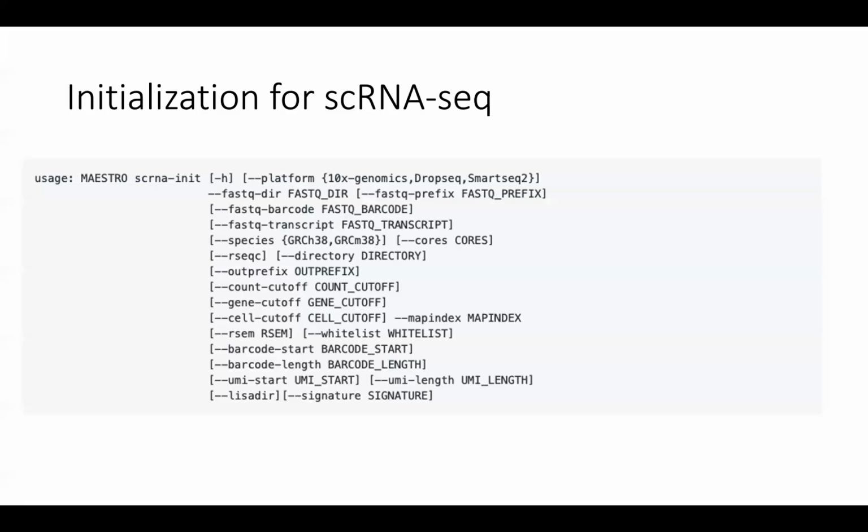And so there's an algorithm, I think it's STARsolo, that, even if two barcodes differ maybe in one nucleotide, can realize that this may have been a mistake, right? Because you're trying to find all reads from the same barcode. And so the whitelist is a list of the barcodes that 10x Genomics actually uses, which can correct for these kinds of sequencing errors.